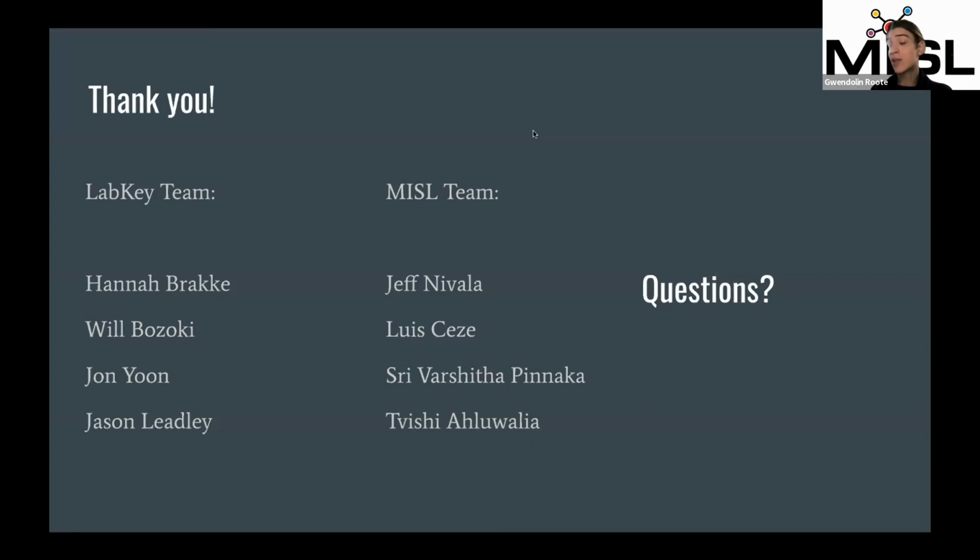In terms of when to reorder reagents, no, I don't use it for that at this point, but I am interested in doing that kind of thing. I've been looking at ways that we could integrate Sample Manager with some of our ordering. And I think that would be a great future endeavor for Sample Manager. And I talked to Hannah about it before too. They're really receptive to any ideas that we have for improving the software. So that's really special too.